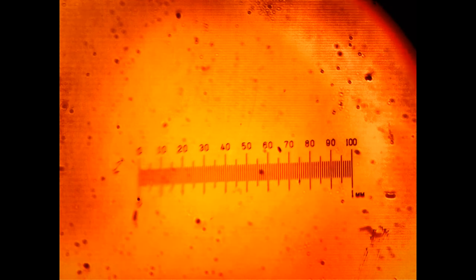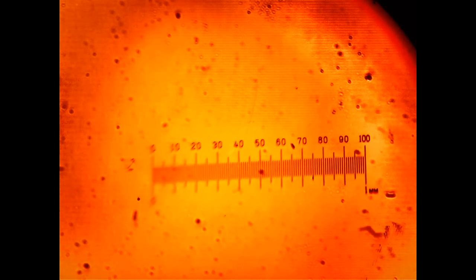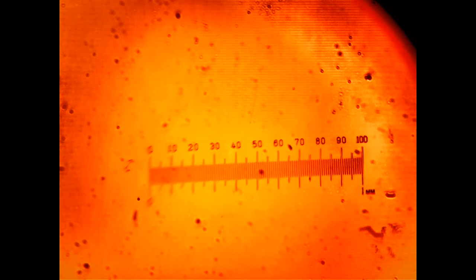Now for a mid-range lens number four, the x22. We can definitely resolve the individual 10 micron lines, and would possibly be able to resolve down to 5 microns if the graticule had been ruled with them.